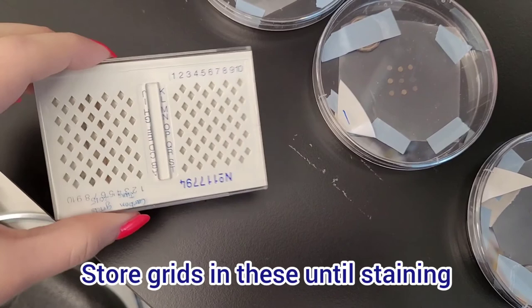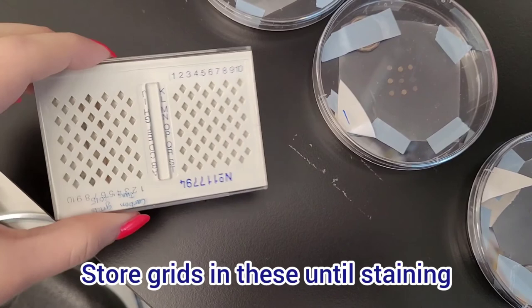Finally, use a tweezer and slowly remove the grids and store them until you want to stain them.